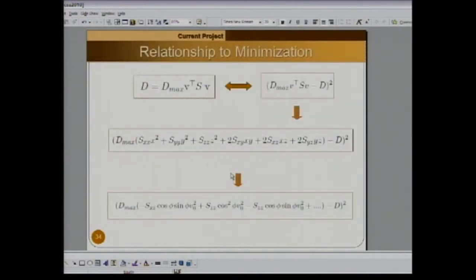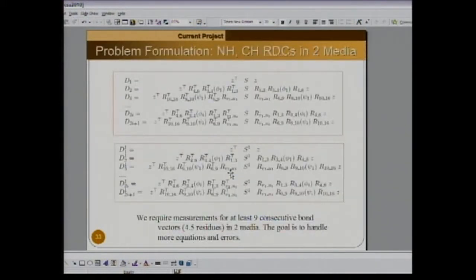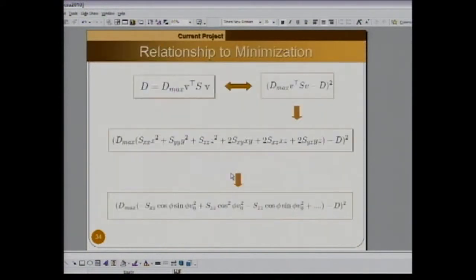So now, how do we solve the overconstrained system? That is the problem, and that's what I've been working on. We have developed an algorithm which was partially implemented. We have partial experimental results for this algorithm. So the way we handle the overconstrained system is in the following way. Solving each equation in each term would be equivalent to minimizing the square term, the function obtained from squaring the difference of the right and left values in each term, because, well, that's just natural.